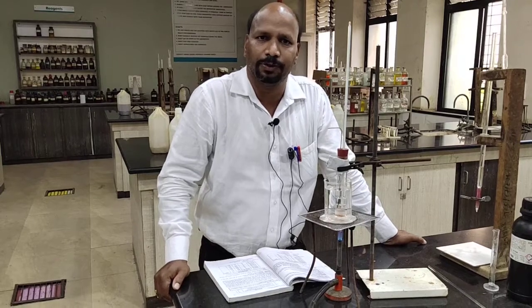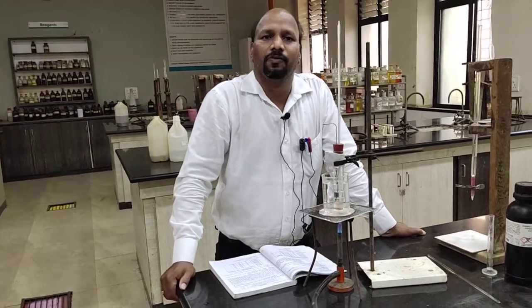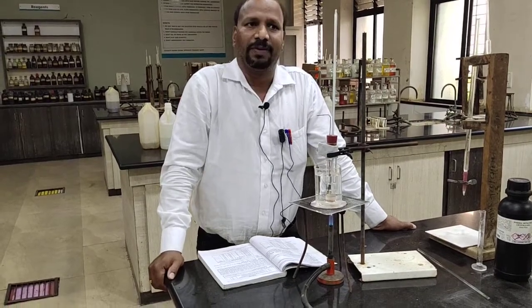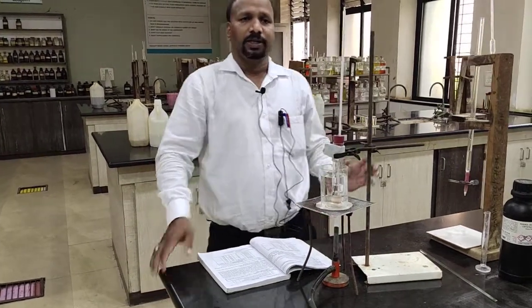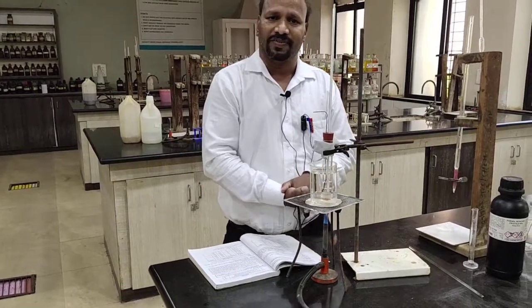We know the density of phenol is 1.053 gram per ml. That means 1 ml of phenol weighs 1.053 gram. Accordingly, we are going to take 9.5 ml of phenol when we want to use 10 gram of phenol. So these are the instructions regarding using the phenol.